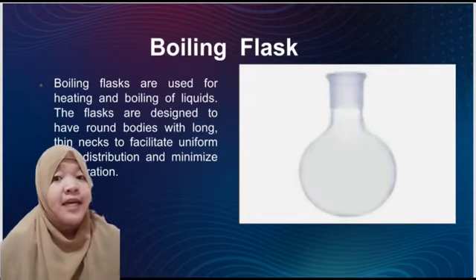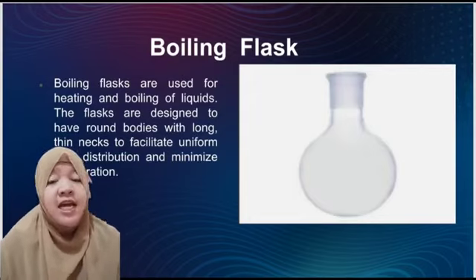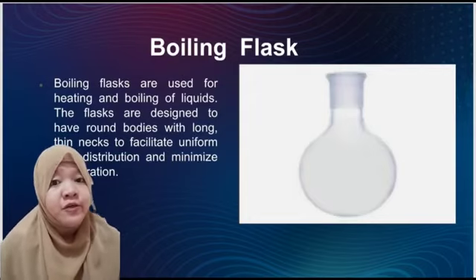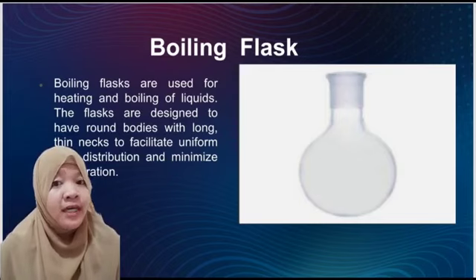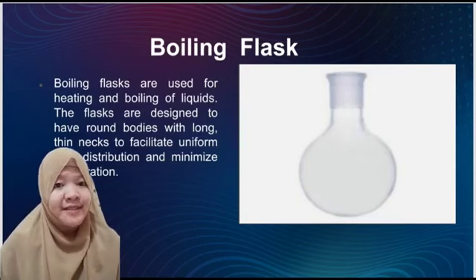And number 4 is the boiling flask. Boiling flasks are used for heating and boiling of liquids. The flasks are designed to have round bodies with long, thin necks to facilitate uniform heat distribution and minimize evaporation.